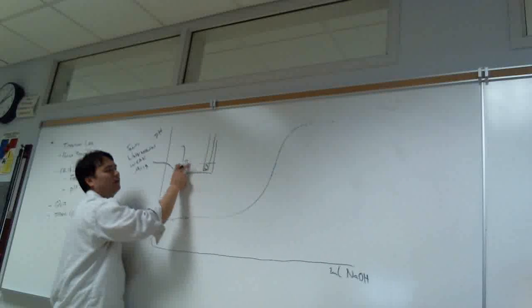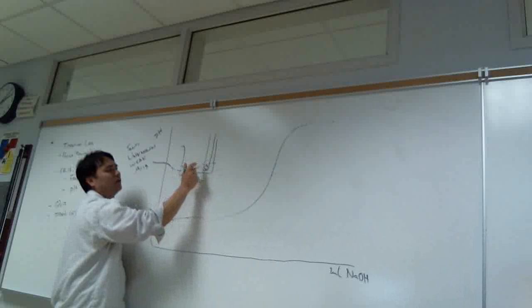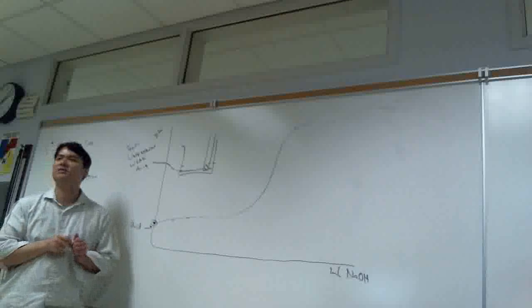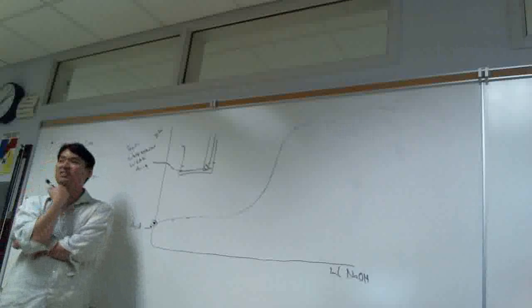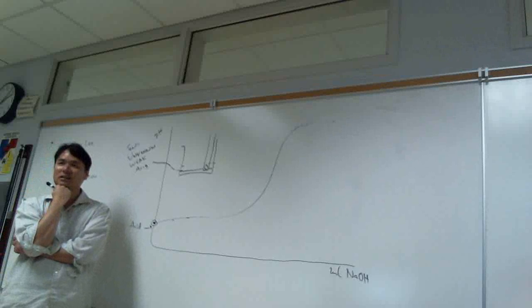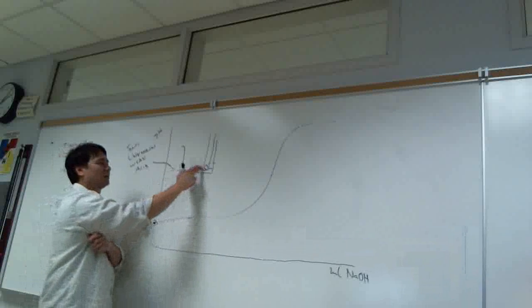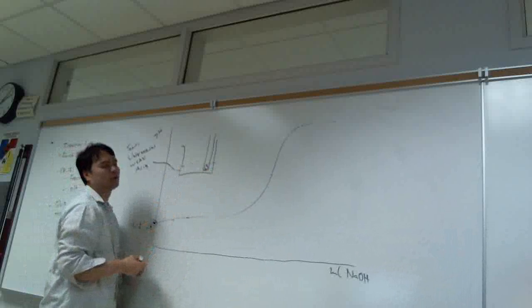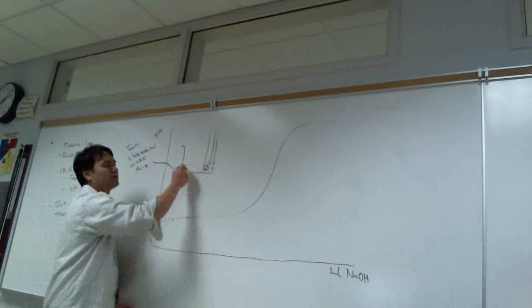If it's only partially submerged, then you are not going to get accurate readings. So if we dissolve it in a minimum and we see that the glass bulb is not completely submerged, then what are you going to have to do? You're going to have to add more water, even though that will hurt you. But the problem is we have no choice because of our probe.